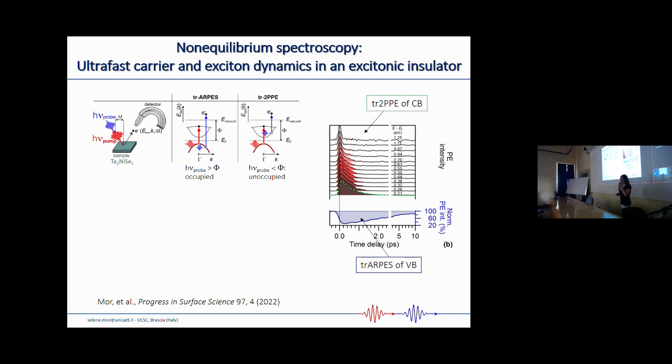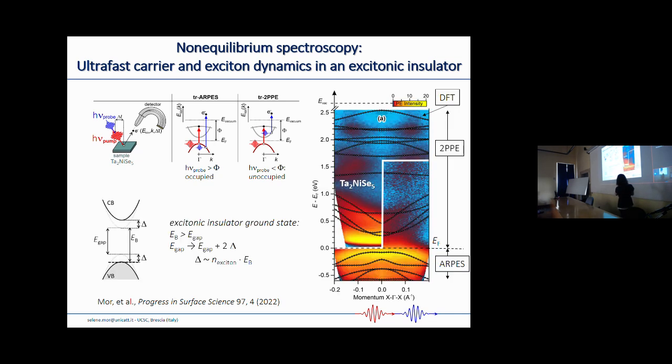So actually there is coupling to phonons. We have seen it with optical spectroscopy first, being even really selective to excitation at the gamma point. Not only this, by doing this type of experiment, I'm not showing here the map, but you do see also oscillation, definitely in the intensity, possibly also in the position of the bands that we are probing in this area.